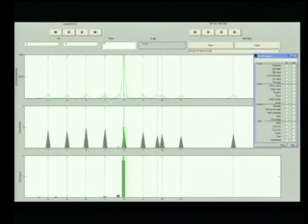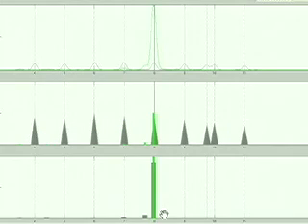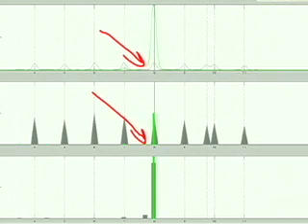Here's the exact same sample in True Allele System 2. In True Allele System 2, if we were to blow up this region, we can see the -A that is visualized here. You can see in this display, in the quantitation display, that in fact there is a small -A peak that is seen by the software system. But then when we get to the actual allele calls that are made, that -A peak has been appropriately filtered.